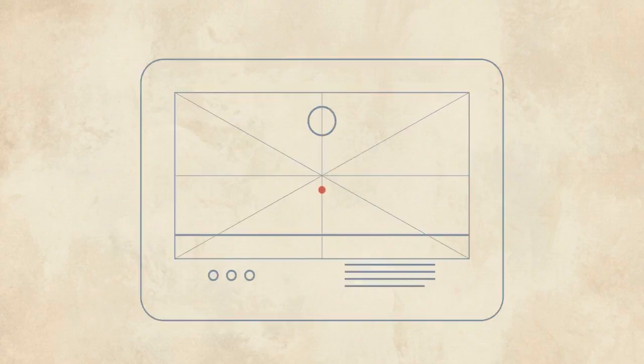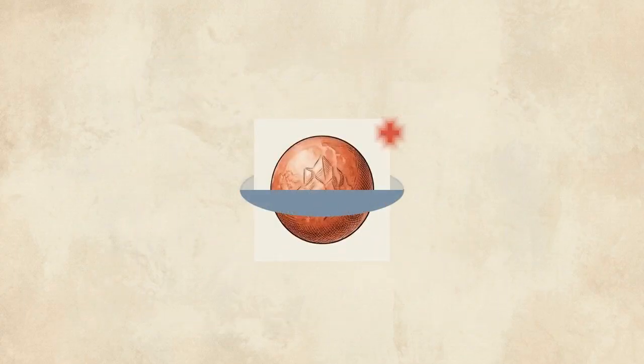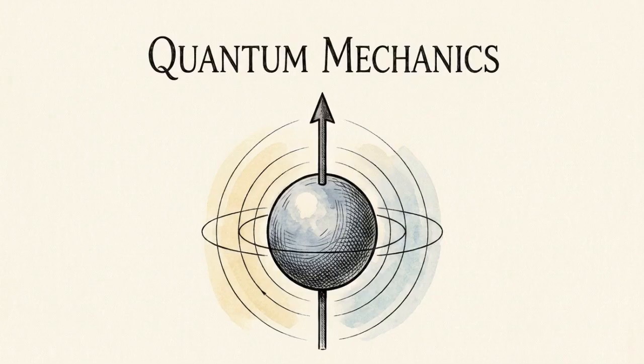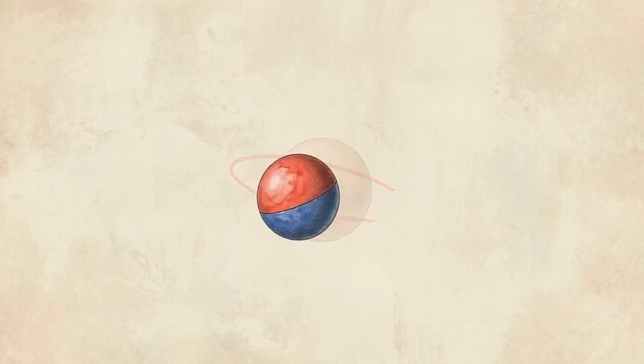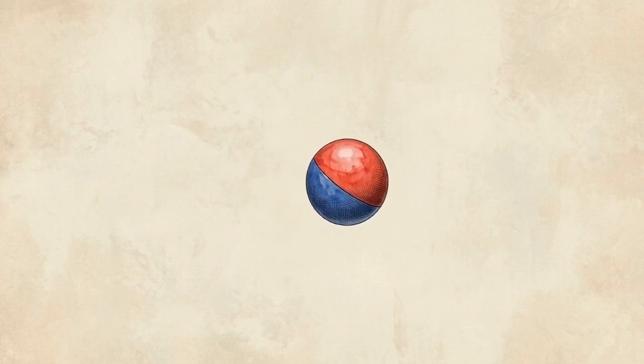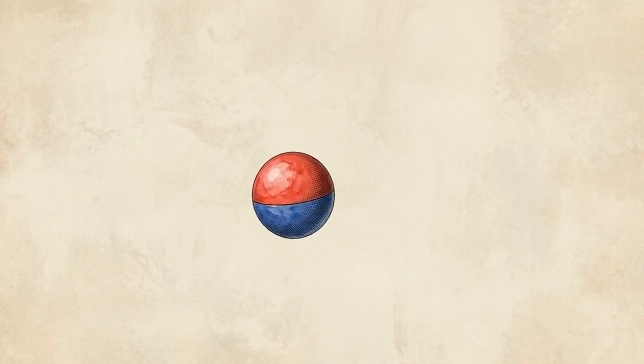We are going to logically engineer an NMR spectrometer from the ground up, starting with the basic quantum physics of the atom. The physical bedrock of NMR relies on a specific quirk of quantum mechanics. Nuclei with odd mass numbers, like hydrogen-1 or carbon-13, possess both an electric charge and mechanical spin. Because any spinning charge generates a magnetic field, these specific nuclei act exactly like tiny bar magnets.